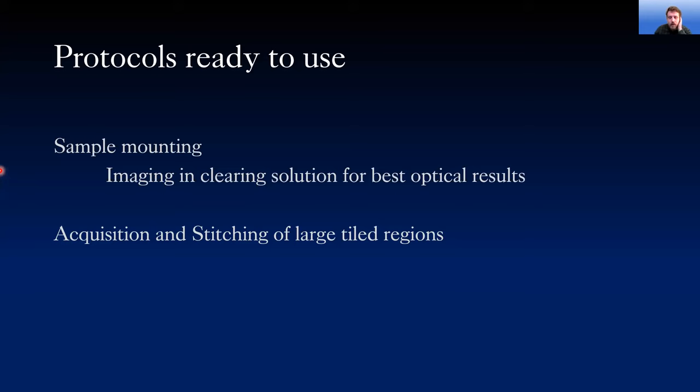In-house protocols that we've really worked with a lot are being able to mount these samples effectively and get the clearing to be maintained. It's a process that we're in the process of publishing actually. Imaging and clearing solutions with this type of setup, it took a bit of time to work out how to work that one through. And then the acquisition and stitching of the large tiled regions. So that's all been worked through and effectively scripted now.